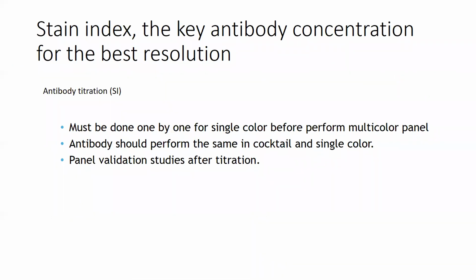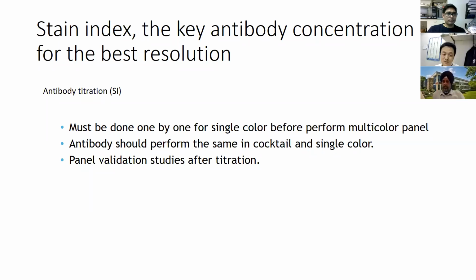So after you pick the colors, I have lots of users come to me and I look at their protocols. The most common thing I see is adding a 1 to 100 or 1 to 200 dilution of antibody to their cells. But then I ask how many cells are in your solution. Most people don't know. They don't even count. So that will be a big problem.